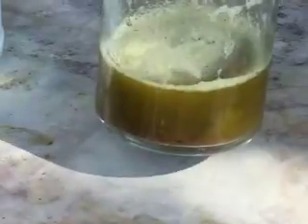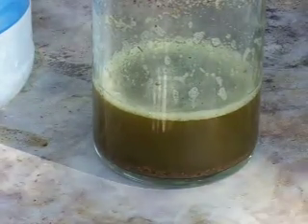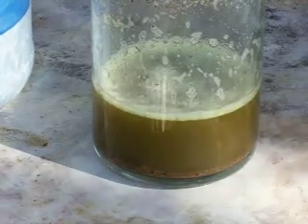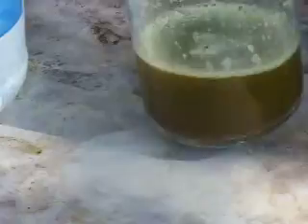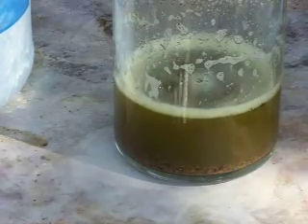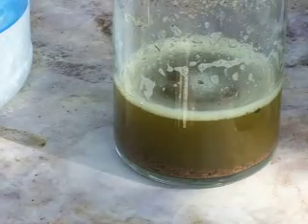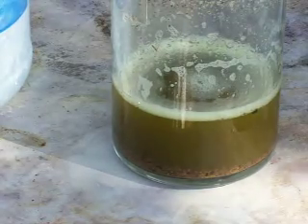There it is — dissolve the gold with common household products: muriatic acid and household bleach. Now this only works with foils and powders; you can't dissolve a ring or a necklace or something like that. Even though it would work, you'd wind up with gallons and gallons of solution trying to dissolve a few grams of gold. So this method is only for foils and powders. When I start to filter this I'll come back and give you a nice shot of the filter and the process for that.